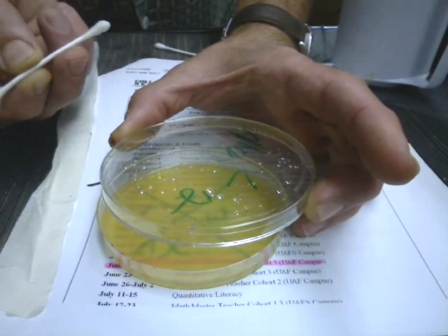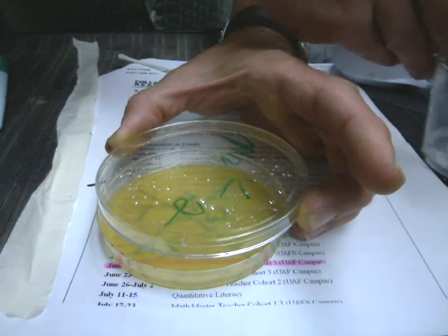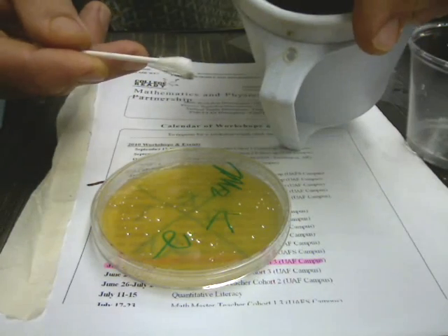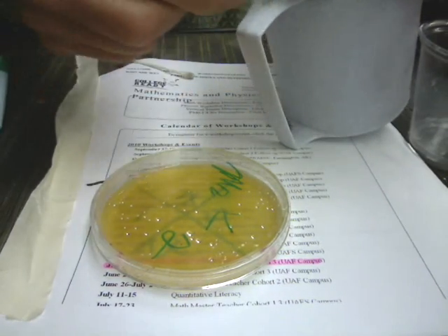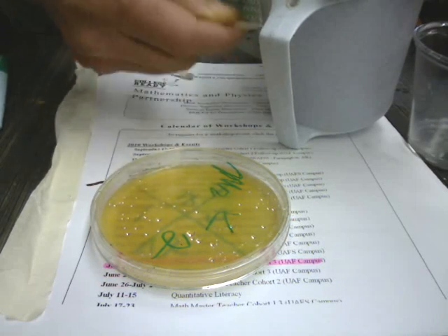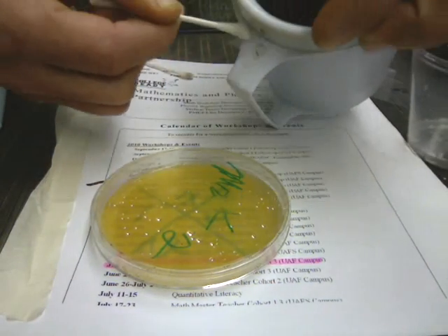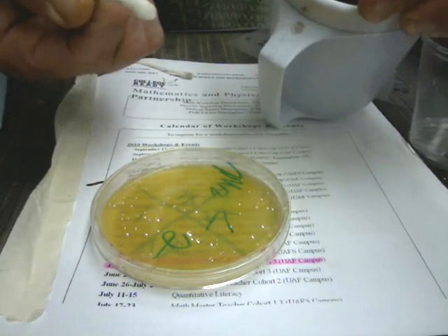Then we'll use Q-tips, moistened in a little water. So you'll take a Q-tip, get its tip moistened in a little bit of water, and then approach the surface you want to get a sample from. Maybe it's the bathroom door, or maybe it's your table, or who knows what. Rub it all over while twisting the Q-tip so you get stuff all over it, and try to concentrate on cracks and crevices. Any weird spot where stuff would collect will be collecting bacteria.